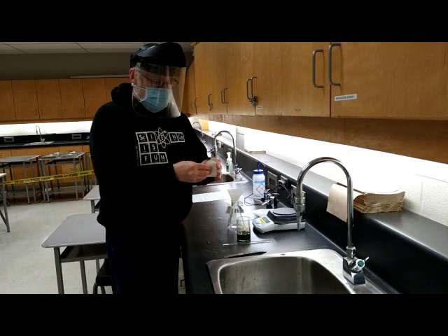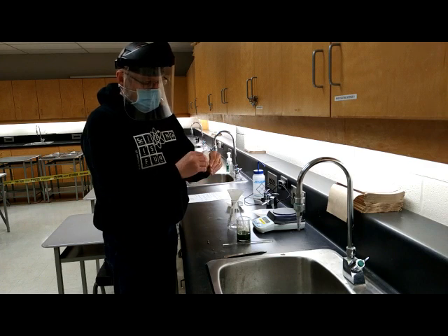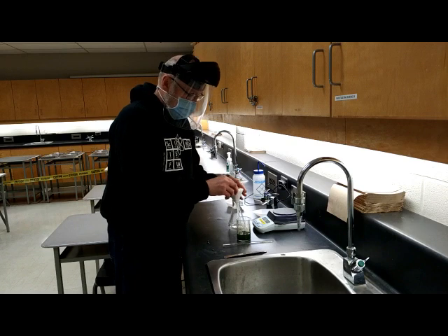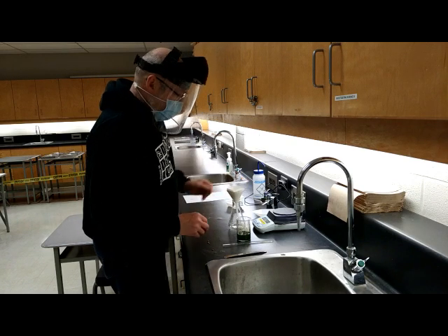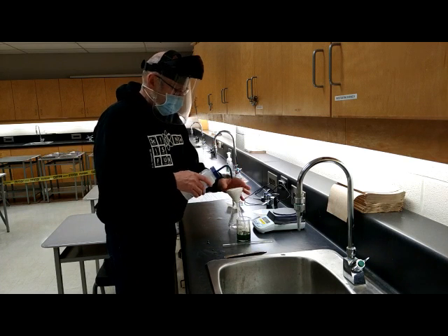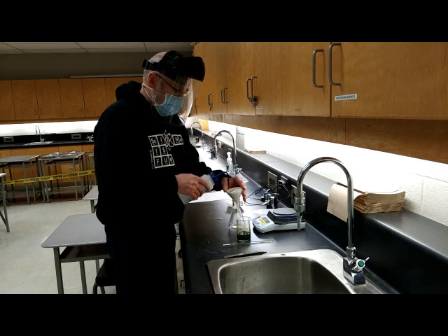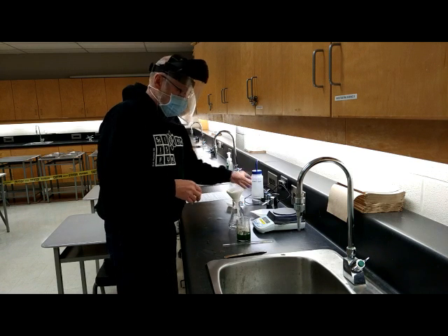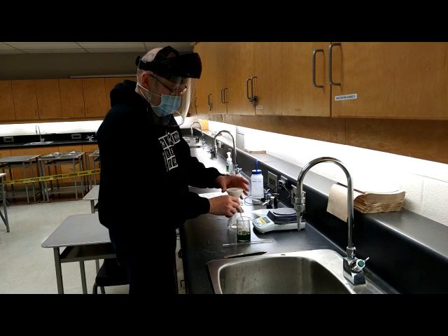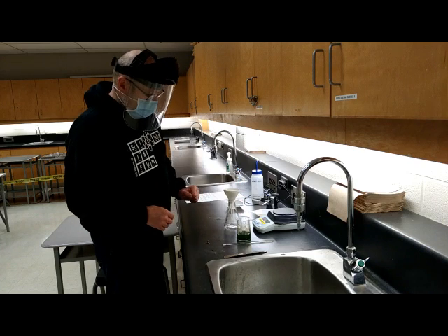We take 3 sides on one side and 1 on the other to make the cone. And that goes into the funnel. All right, what I like to do now at this point, you can see it sort of wants to unfold itself. And so I usually just wet the filter paper, and that way it sticks to the sides of the funnel and will hold its shape a little better.